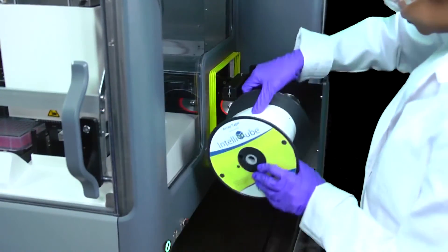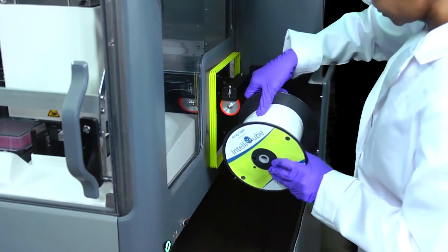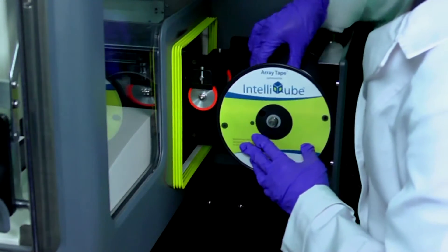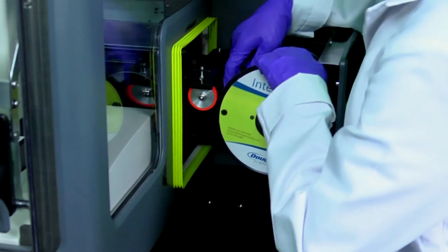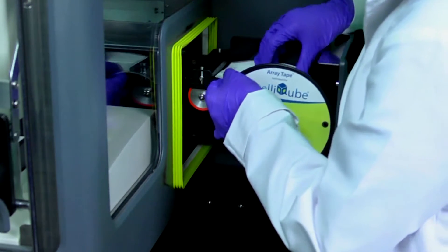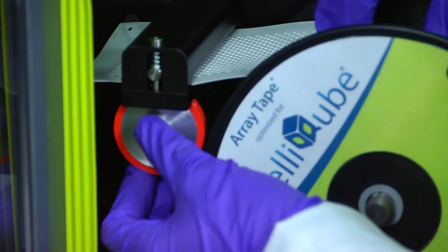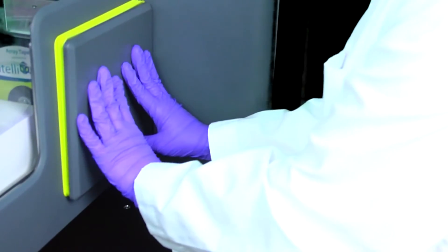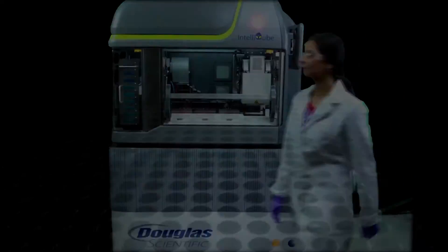The instrument is optimized for use with an opaque white polypropylene ArrayTape specifically designed for the IntelliQube. In addition to our standard 384 well ArrayTape pattern, our new 768 well interlaced pattern enables even higher throughput.